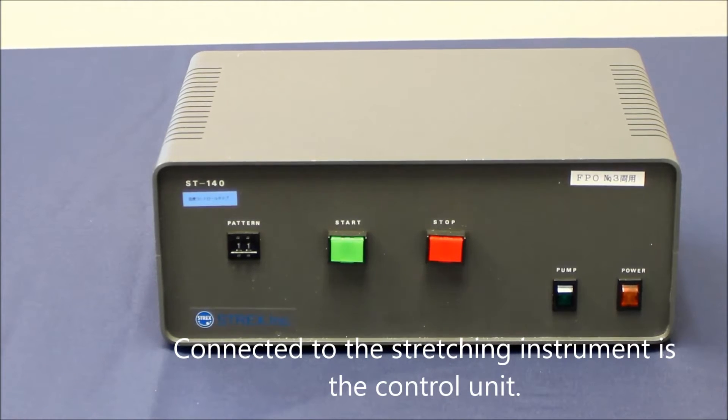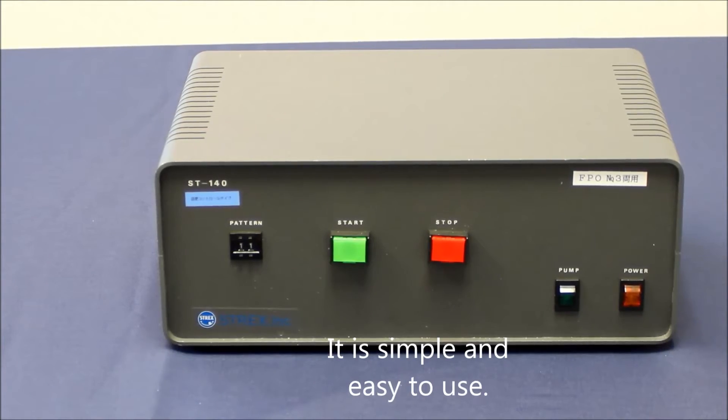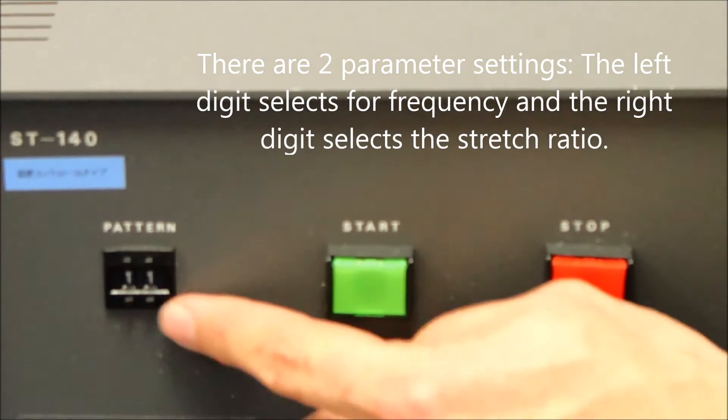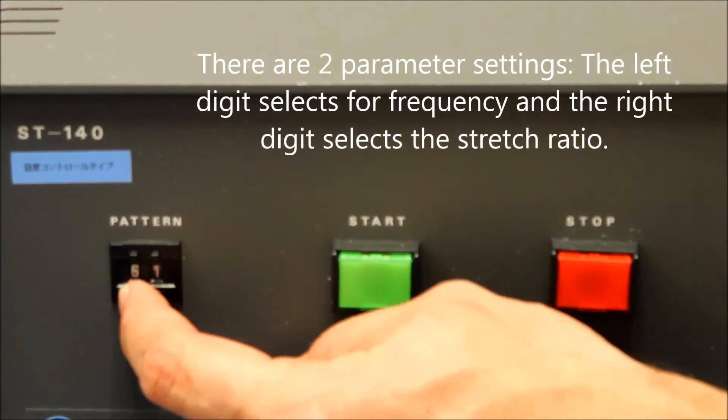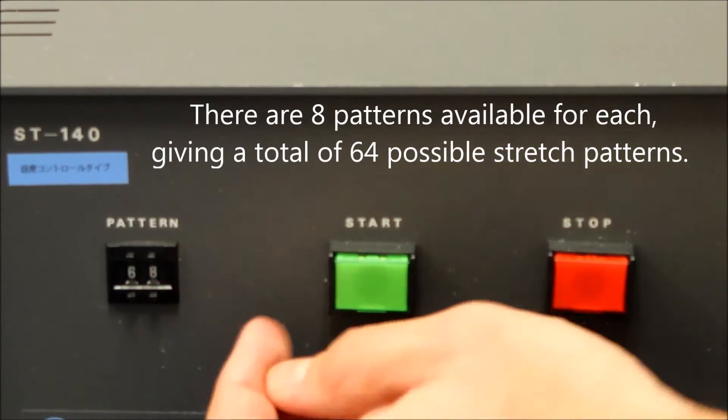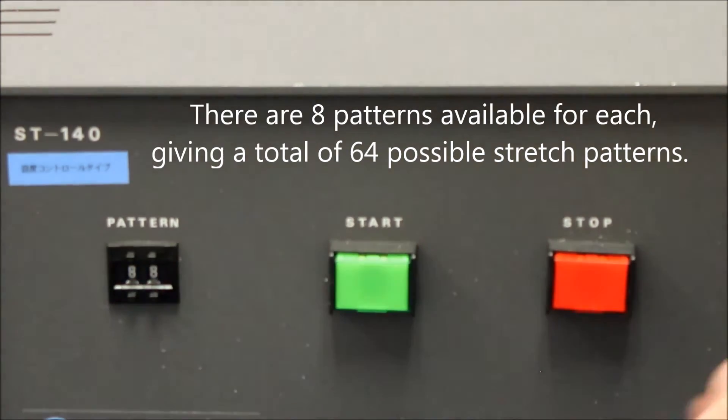Connected to the stretching instrument is the control unit. It is simple and easy to use. There are two parameter settings: the left digit selects for frequency and the right digit selects for stretch ratio. There are eight patterns available for each, giving a total of 64 possible stretch patterns.